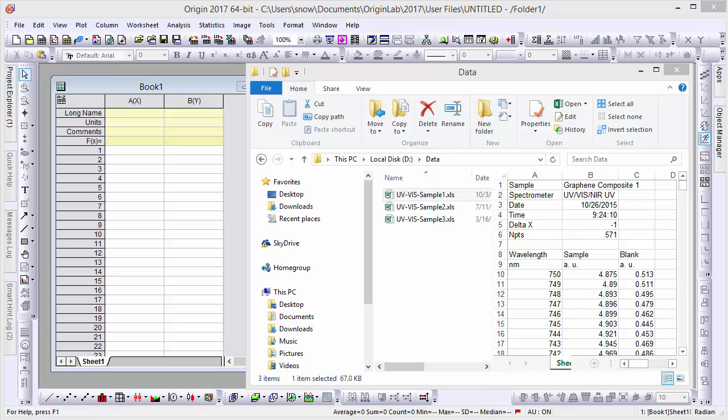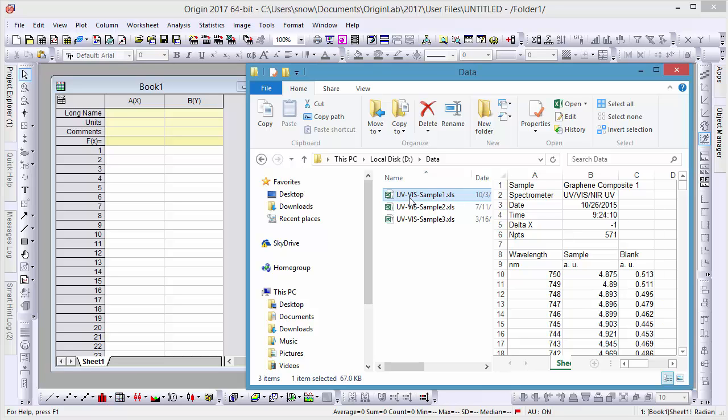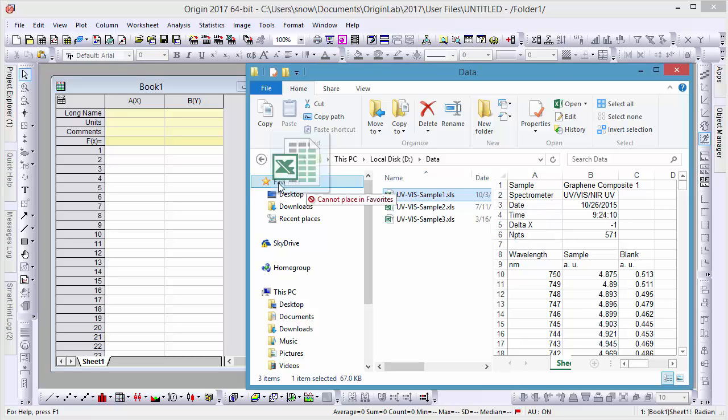Importing data into Origin is very easy, with drag-and-drop support available for many standard formats. For example, here we have an Excel file we'd like to import.